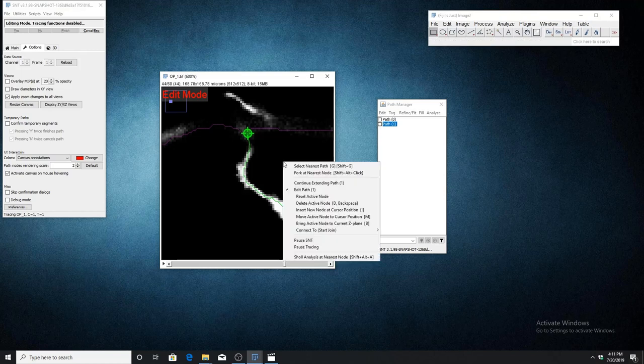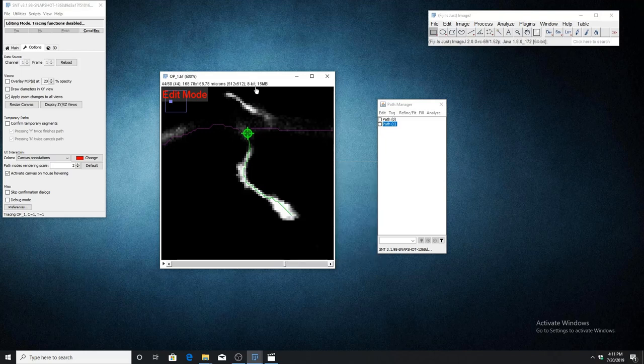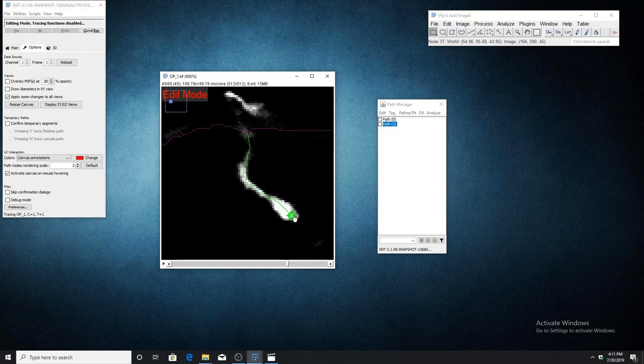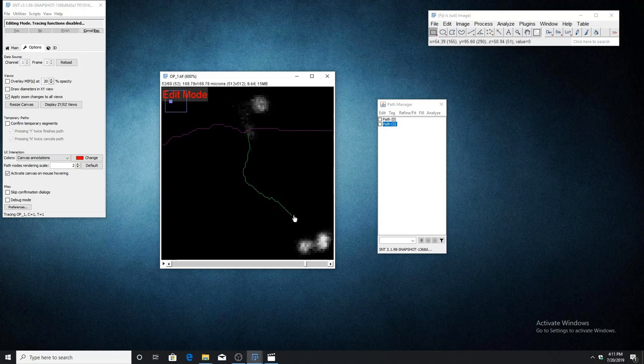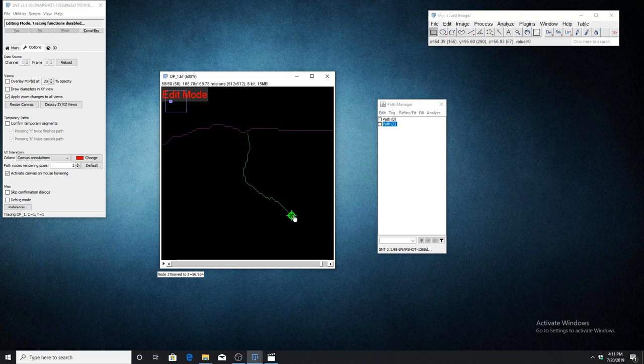The next function is bring active node to current Z plane with keyboard shortcut B. Like always, hover over the node you want to be moved, then scroll through the image stack to the new Z slice where you want this node to be. Press B on the keyboard and you'll see that this node has been moved to this new Z slice.